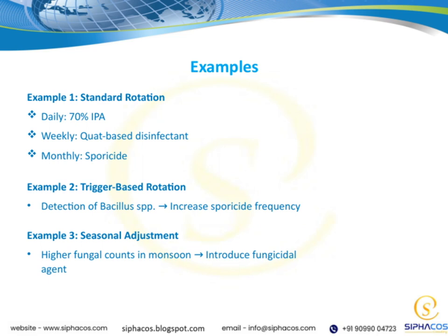Moving on to the trigger-based rotation, this method adjusts based on specific detections. For instance, if we detect Bacillus spp, which are spore-forming bacteria, we increase the frequency of sporicide use. This targeted approach ensures we respond effectively to potential risks, making our disinfection process more dynamic.